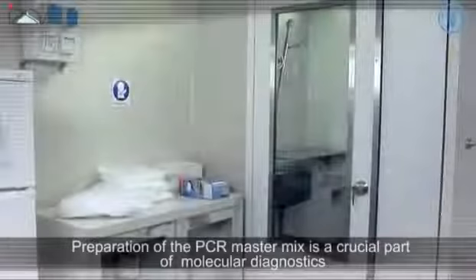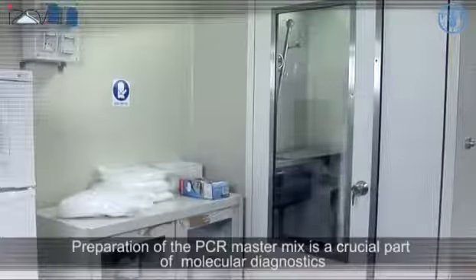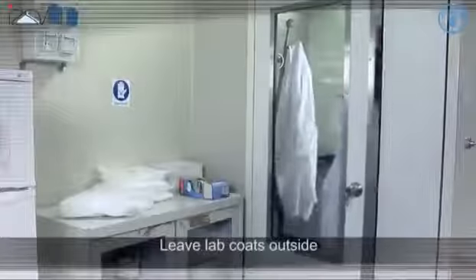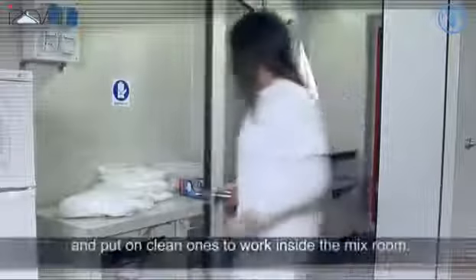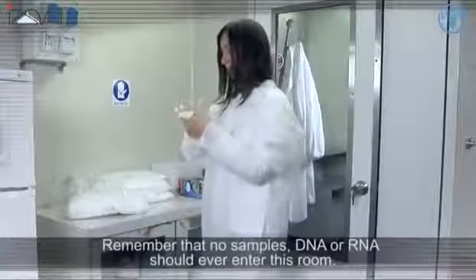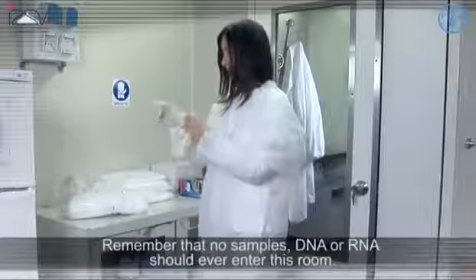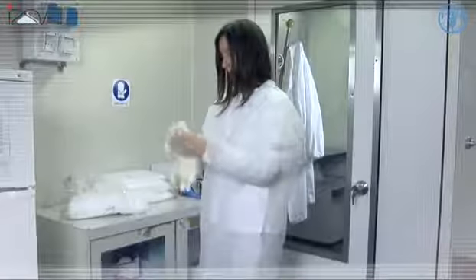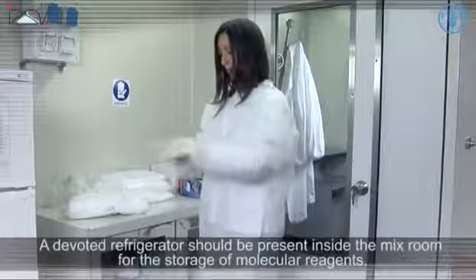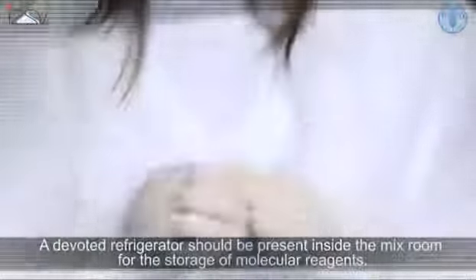Preparation of PCR master mix is a crucial part of molecular diagnostics and it should be done in a devoted room with dedicated equipment. Leave lab coats outside and put on clean ones to work inside the mix room. Use clean disposable sleeves and gloves to avoid any risk of contamination. Remember that no samples of DNA or RNA should ever enter this room.